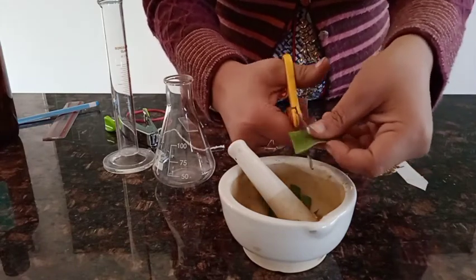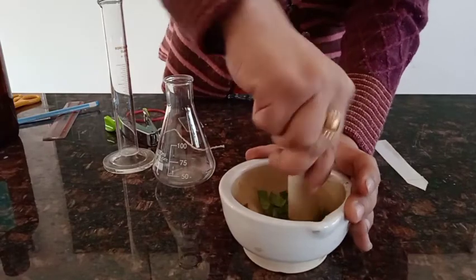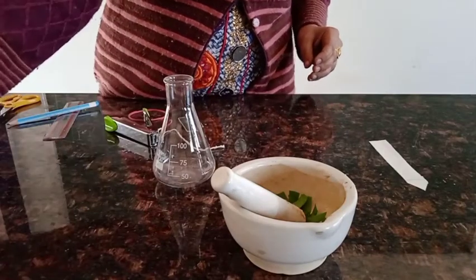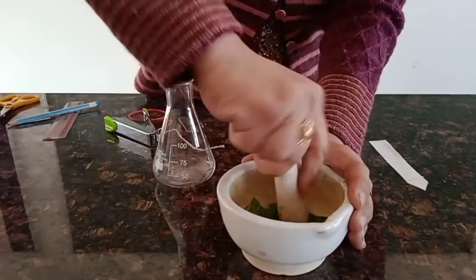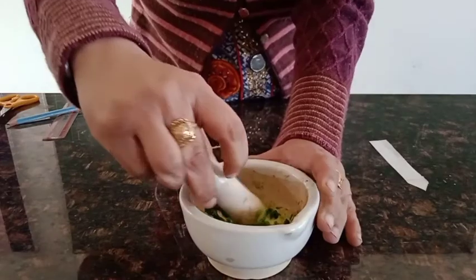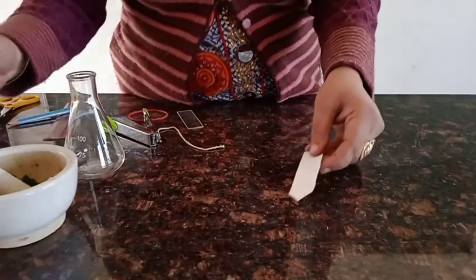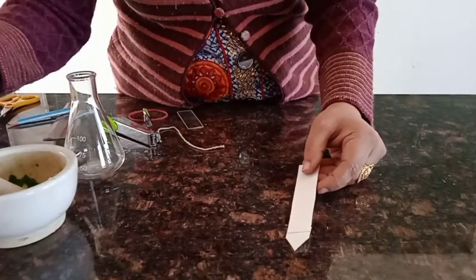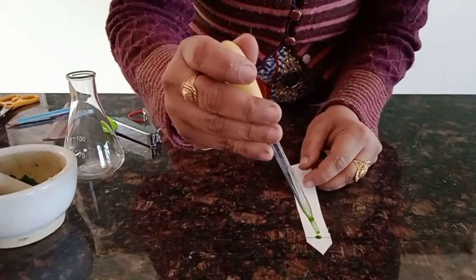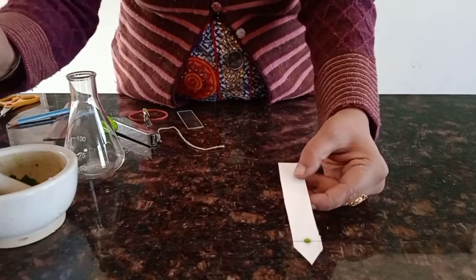We'll finely chop the leaf first and then grind it to a paste. We need to add a little quantity of acetone while grinding. Then, with the help of a capillary tube or dropper, we'll place the plant extract in the middle of the line drawn on the chromatographic paper.